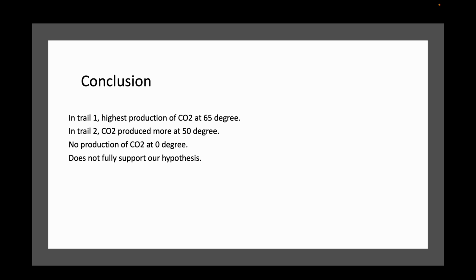In this experiment, with the increasing temperature, the production of CO2 was increasing and the fermentation of yeast was also increasing. For future research, it would be recommended that they take higher temperatures like 80 or 100 degrees to fully support their hypothesis, because it could be possible that if they take a higher temperature, the CO2 production will decrease at the 80-degree temperature, which would further decrease the yeast fermentation.